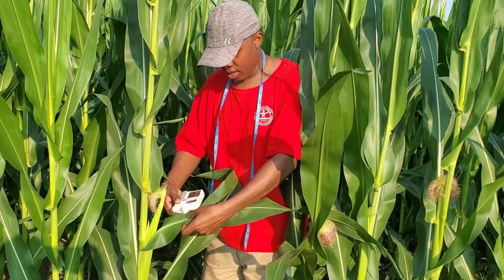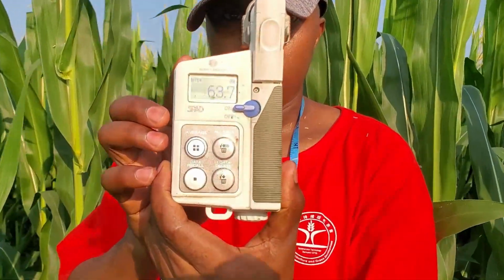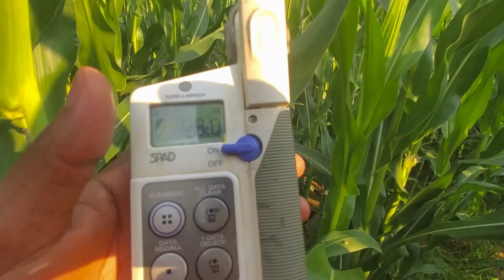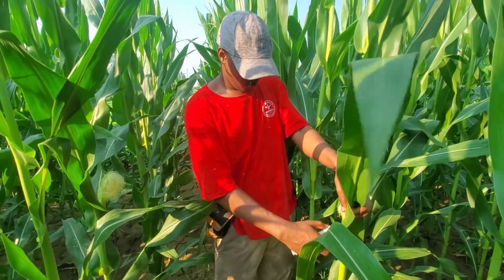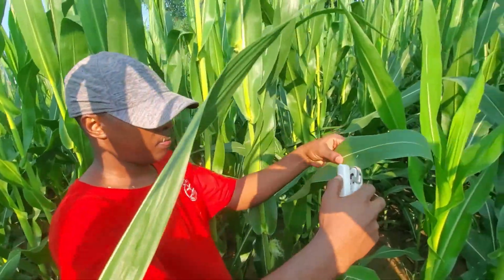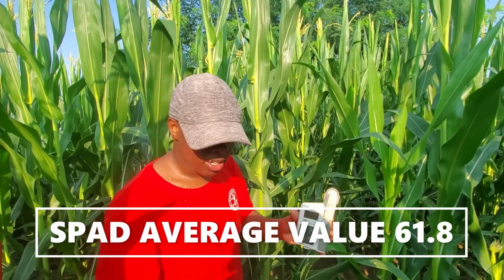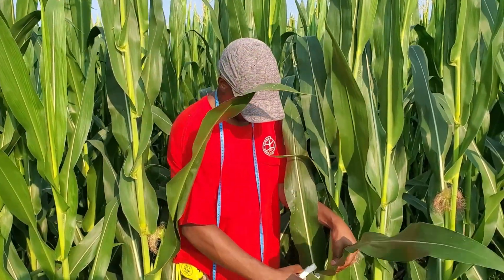Most important, when you measure the SPAD, you take it from the leaf that is on the cob. You can see the value 63.7. If you use this instrument, first you need to clear, and after clearing you go to your plants, select the leaves that are alongside, like the leaf with the cob or ear, and then you punch the first time, the second and the third, and then you get the average. That average value, like this one, shows 61.8, which shows there is a high amount of nutrients. You can keep doing the same procedure.